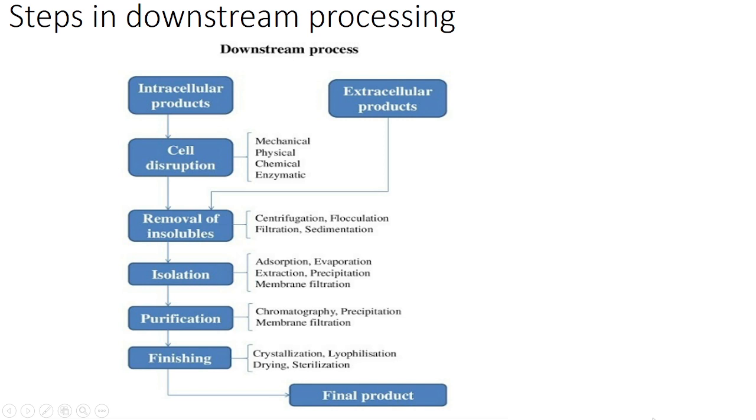Okay, and always remember, all the downstream processing need not follow every step described here. Some might require one or two of the steps. Some might require all the steps. Okay, and we can see it.